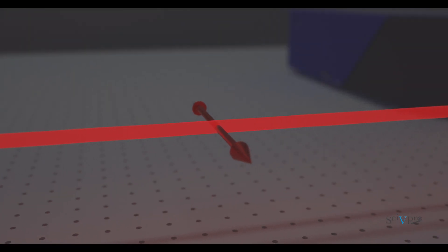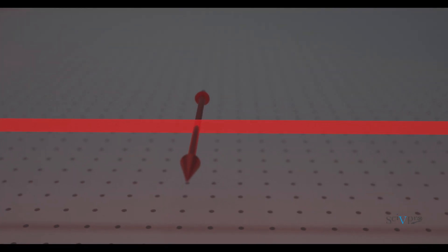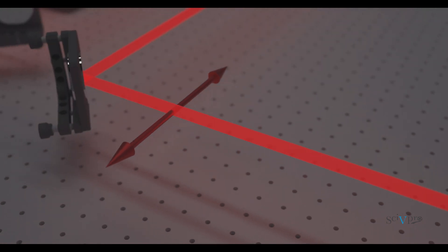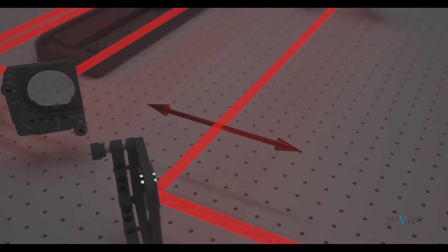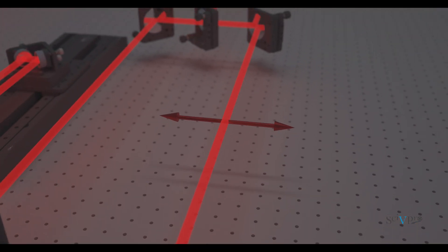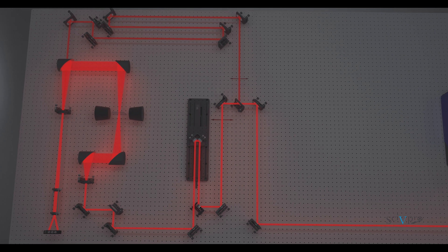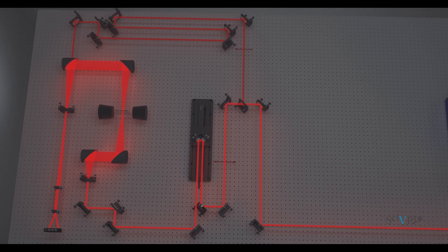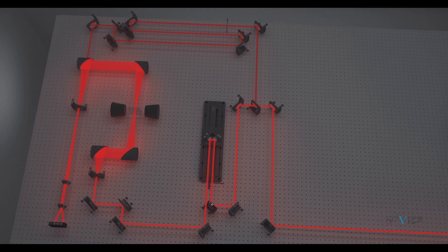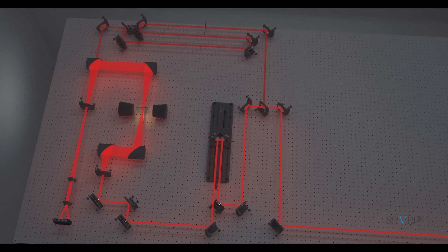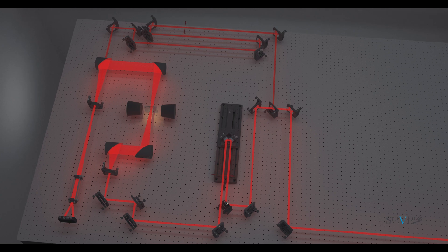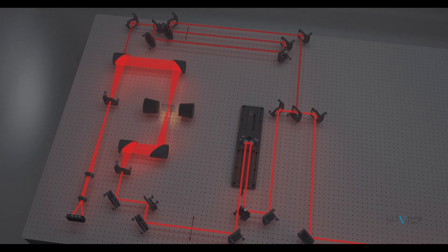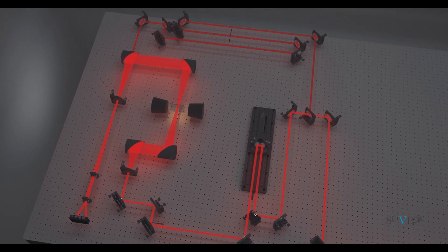Our Terahertz Time Domain Spectroscopy is capable of performing Terahertz transmission and Terahertz emission spectroscopy. In the case of Terahertz transmission, we steer a Terahertz pulse to a sample and detect the transmitted Terahertz pulse as the output signal.